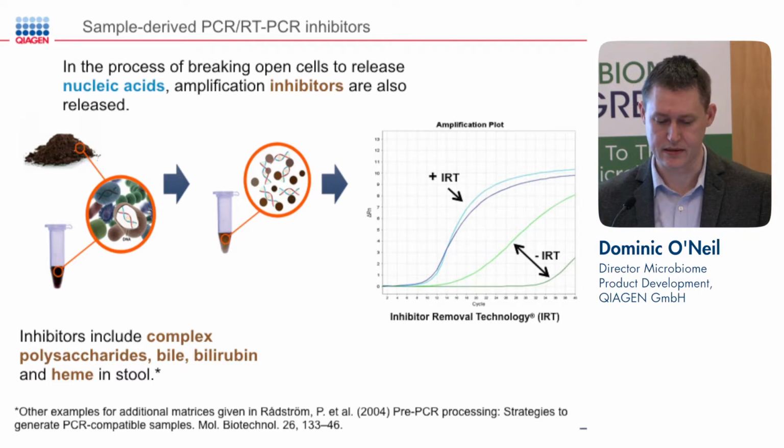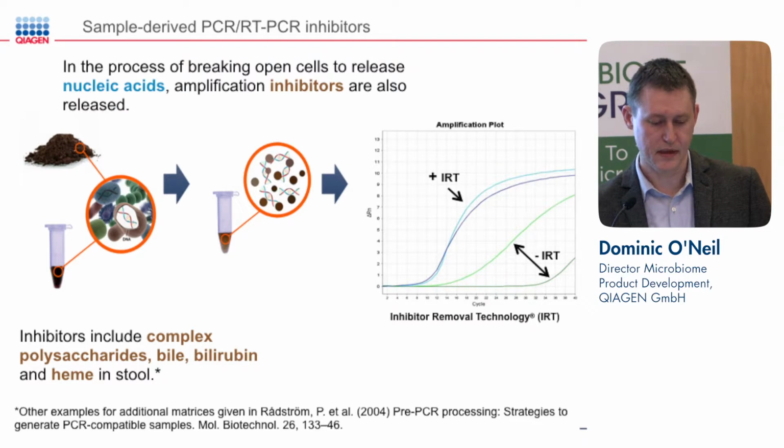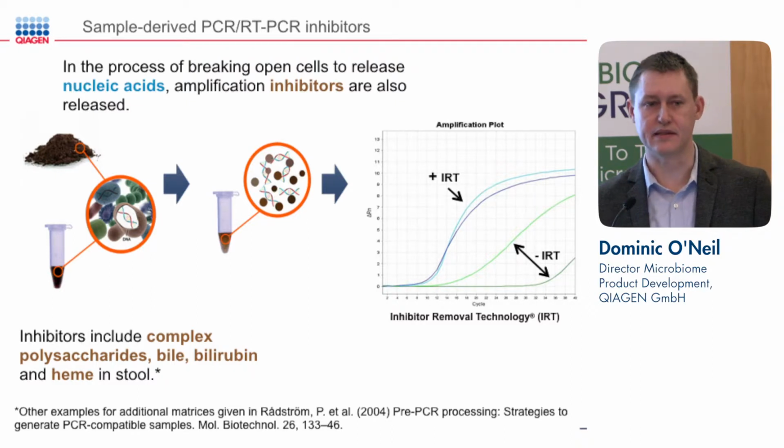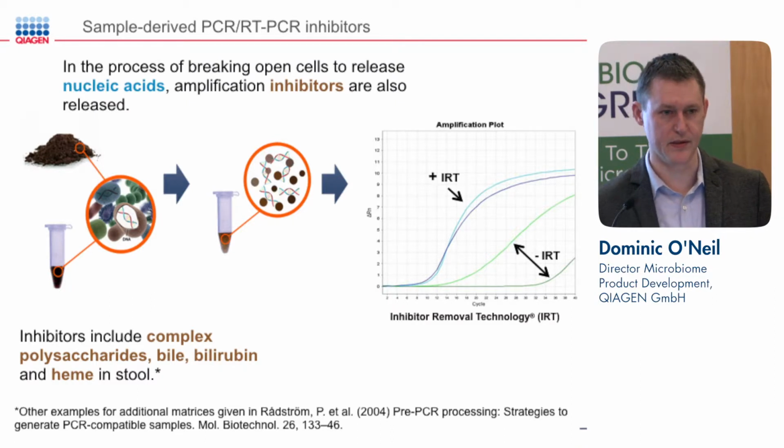And in the other case, also just not nearly as clean of an amplification. And these will cause bias in your downstream applications. Like I said, this is essential because on normal quality specs, you won't necessarily see that these inhibitors are present because they're too similar to DNA in many cases that they'll still show up.